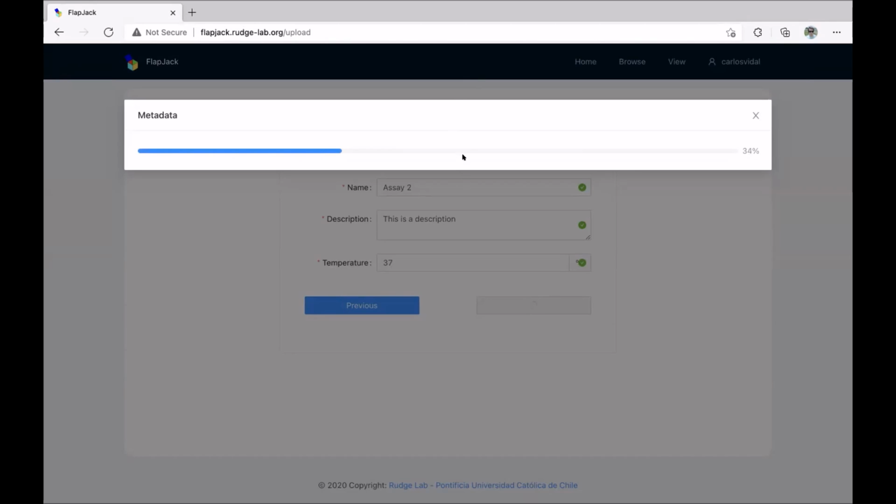So going again with the modularity in terms of analysis or in terms of modifications of the database for different types of experiments, we would also like to have this modularity in terms of adding different machine parsers. So Alex is saying, yeah, from our Tecan Spark, we can develop the parser for that. Or we could work together on that.